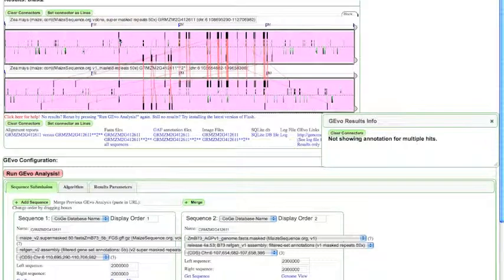If the blocks are drawn above the gene models, this is when the regions of sequence similarity are in the same orientation. When they're drawn below the gene models, this is when they're in the opposite orientation and one of these regions has been inverted with respect to one another between the assemblies of the maize genome. From this we can see that overall there is a high degree of concordance in terms of the gene order, but there are a couple of regions that have been inverted with respect to one another with the new version of the maize genome. That concludes this tutorial on how to visualize differences between assemblies of the maize genome. Thank you.